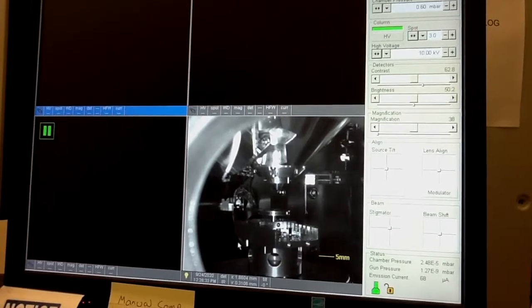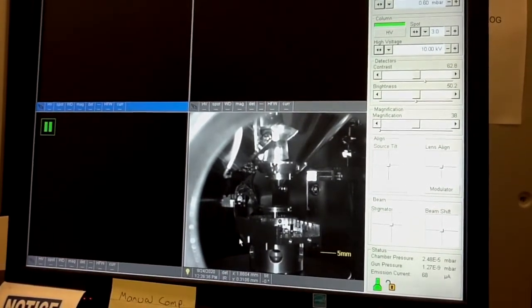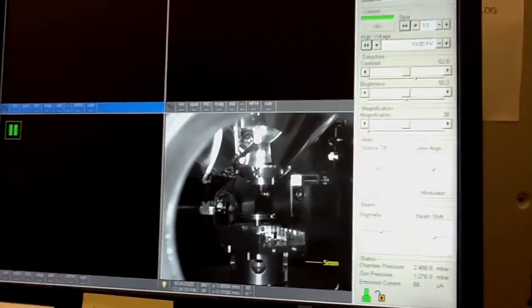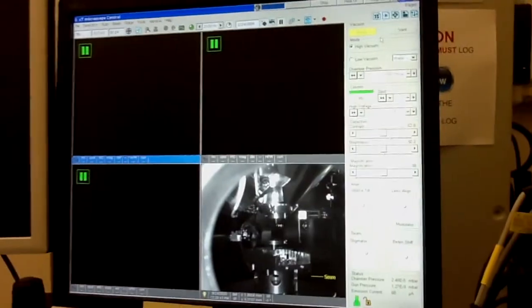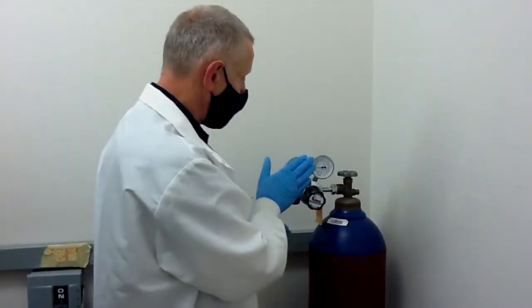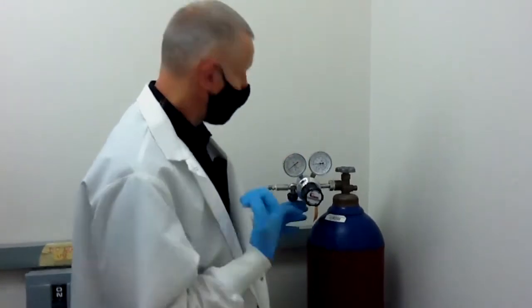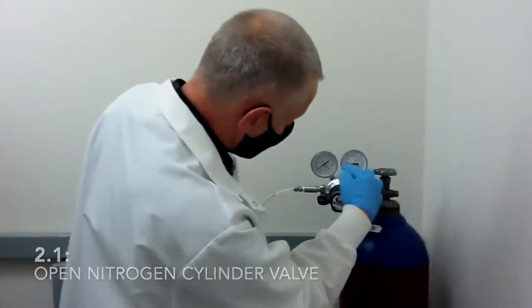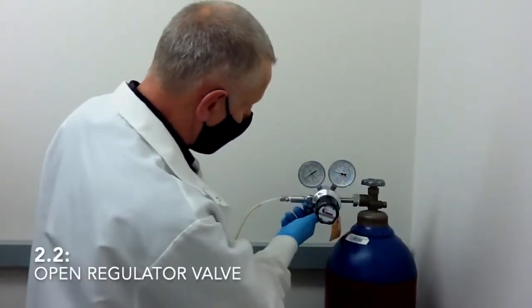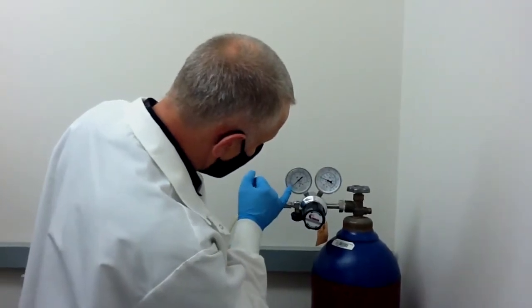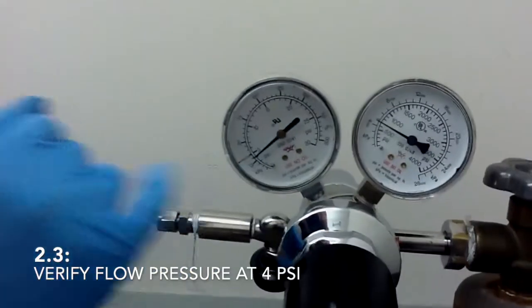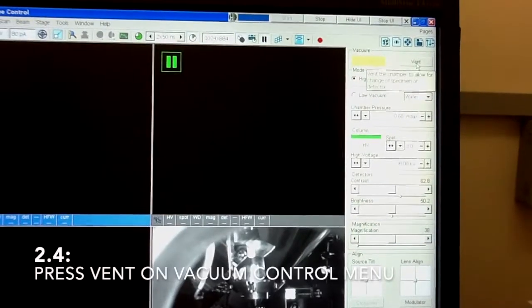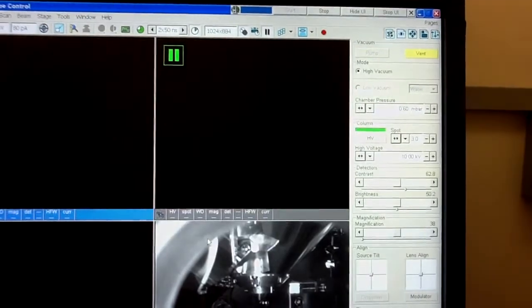Okay, so now you need to vent the chamber and load your sample for the analysis. To do this, first thing, make sure that you open nitrogen gas tank. To vent the chamber, you have to make sure that you have gas flowing to the system. So open the main valve. Make sure that you still have some nitrogen in the tank. Make sure that this valve is open and that the pressure around this black mark here on the regulator.